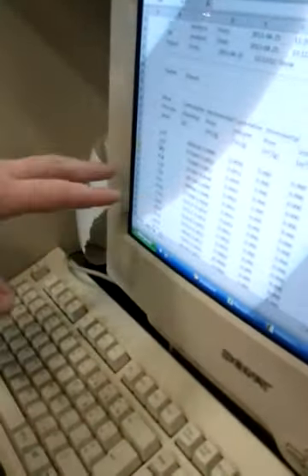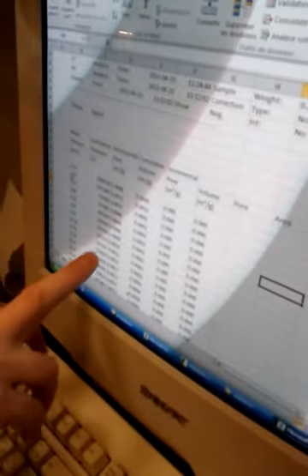of total porosity. And here, so this is the result, the global results, and here it's really the distribution of porosity. If the 40% of the porosity is small pore or bigger pore, okay. This is what we have with the change.